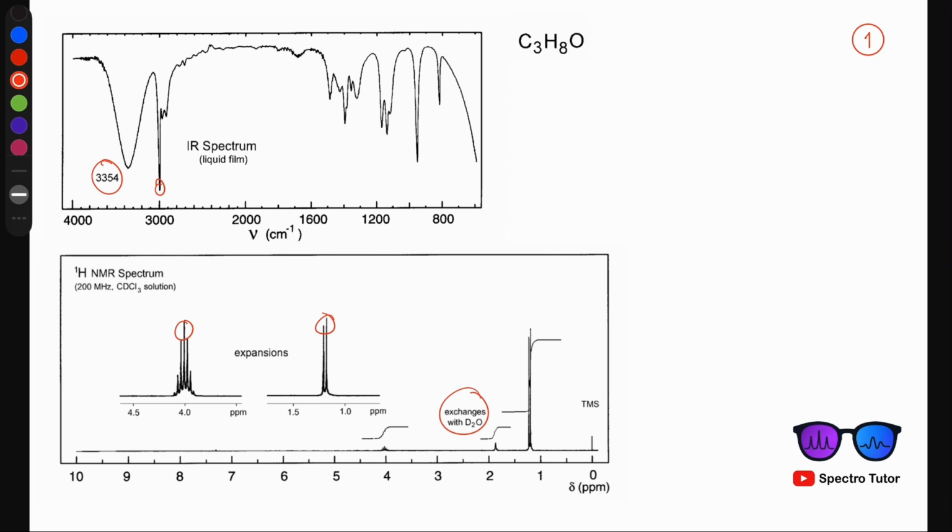So in our approach, we usually begin with the index of hydrogen deficiency, IHD, or you might see in other papers, documents, or books, UI, which stands for unsaturation index, but they share the same concept, and they're actually the same. That gives us the first clue about the compound's degree of unsaturation, and that assists us so much in further analyzing the spectra. It can keep us on the right track and help us find the correct answer and correct structure for our spectrum.